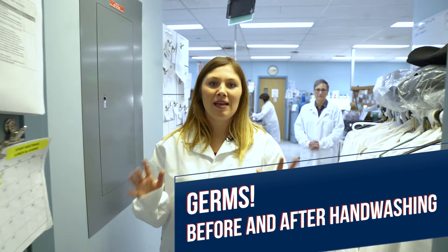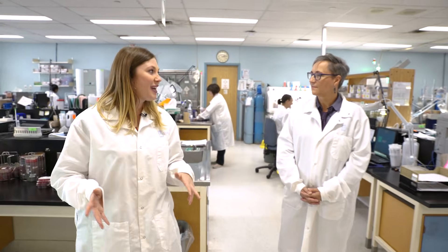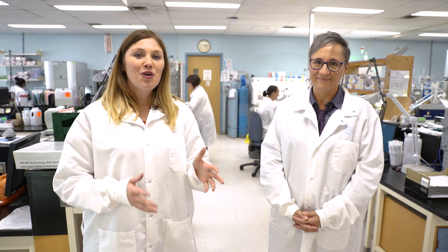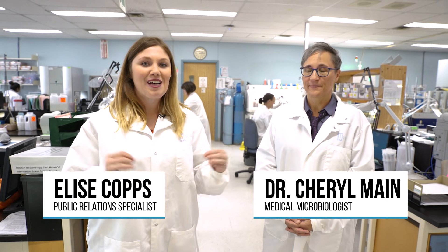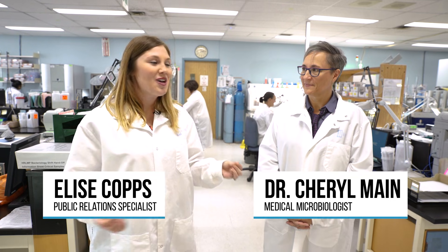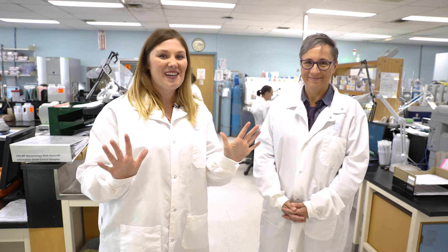We're here at the microbiology laboratory at Hamilton Health Sciences Hamilton General Hospital, joined today by Dr. Cheryl Main. We're going to show you the power of proper hand washing as we come into flu season, and try out some cool experiments so you can get a look at just how gross the stuff on your hands really is.